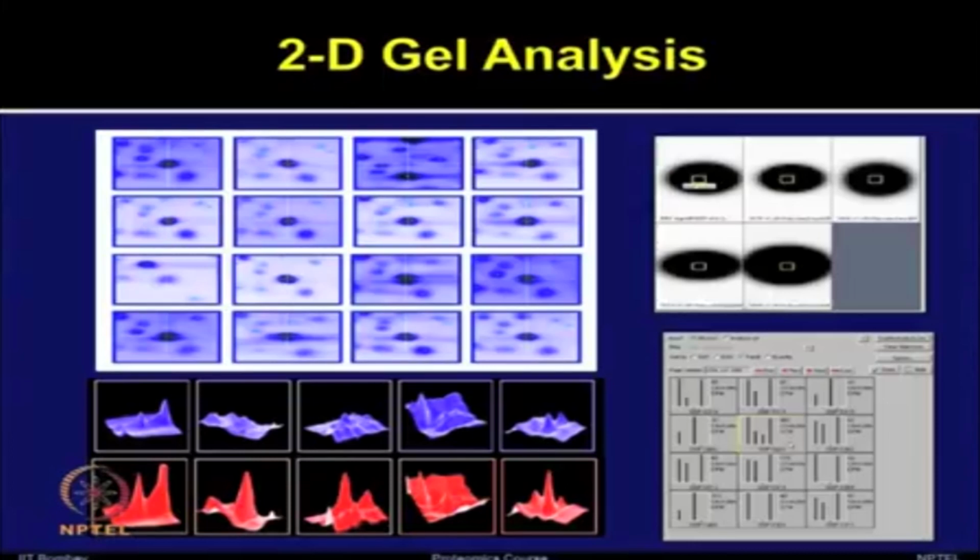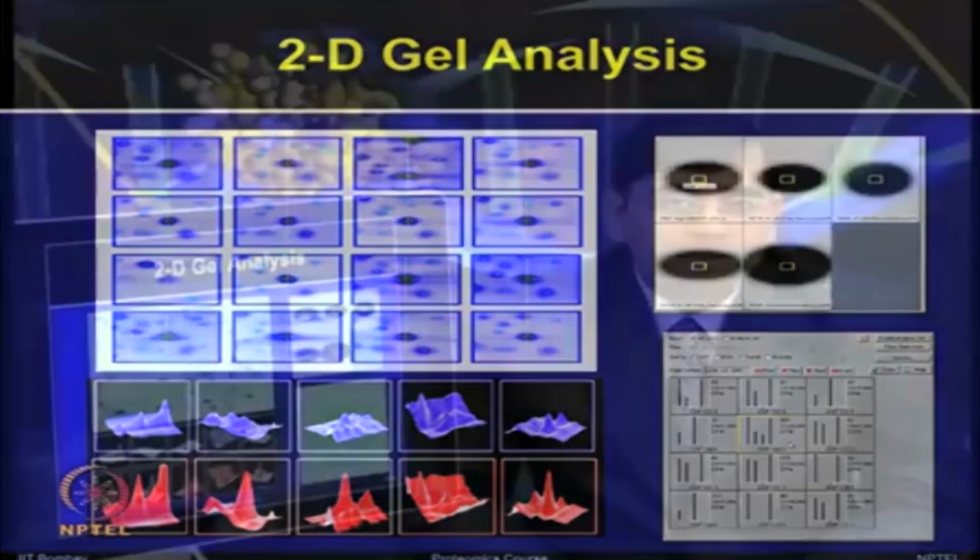So, after looking at 3-dimensional views of this particular protein, you can confidently say that this protein expression is changing and it is going to a higher amount in the treatment. Now, one can look at each of these spot intensities in much detail, followed by plotting different types of parameters for percentage volume or spot intensity to compare their values and do the statistical comparison.